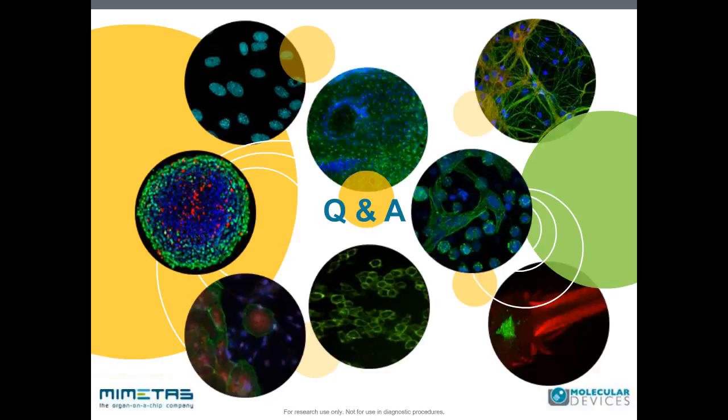You can also automate putting the plates into the machine. And I think the most important part is the software package associated with the ImageXpress that allows us to do almost fully automated image analysis on either flat images or image stacks, which saves a tremendous lot of time and which is basically hard to get for a standard automated microscope. So I think that would answer the question.